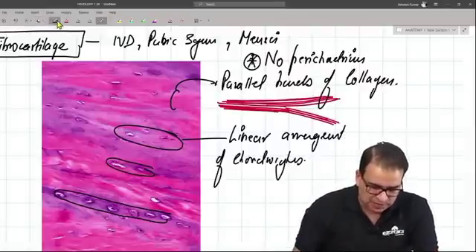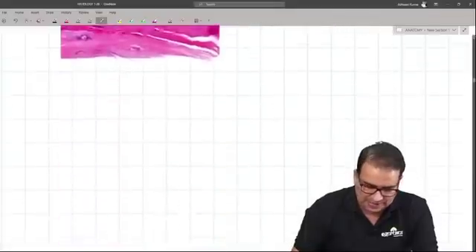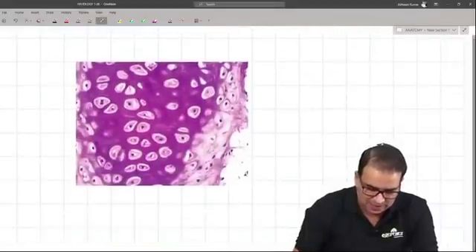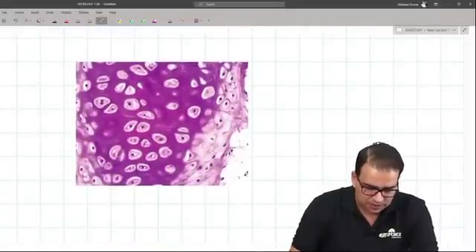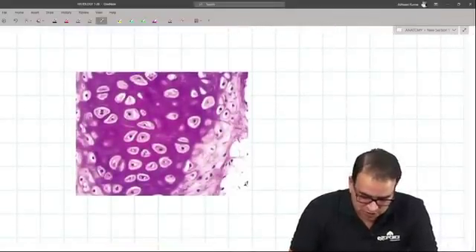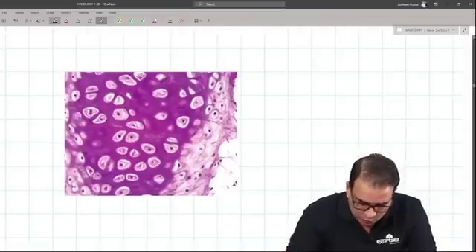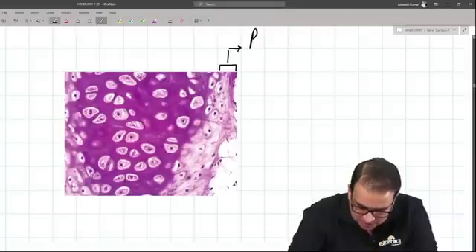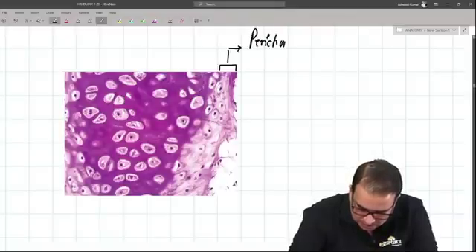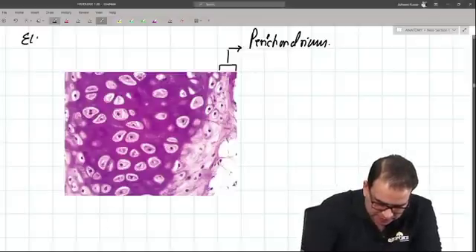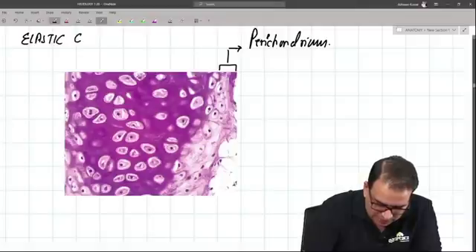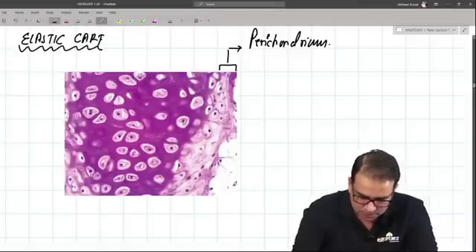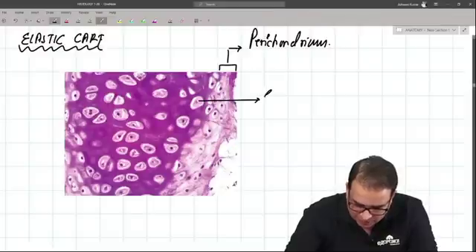Moving on to slide number seven — this is a slide of elastic cartilage. Elastic cartilage does have a perichondrium. You can see a cellular layer as well as a fibrous layer of perichondrium. The chondrocytes are again present in lacunae.